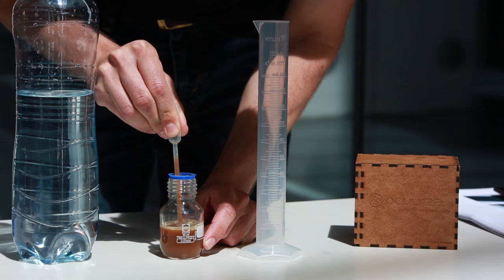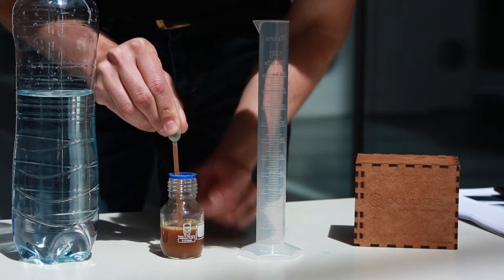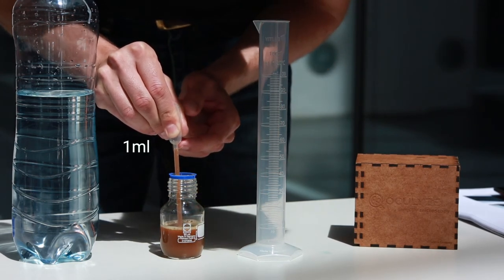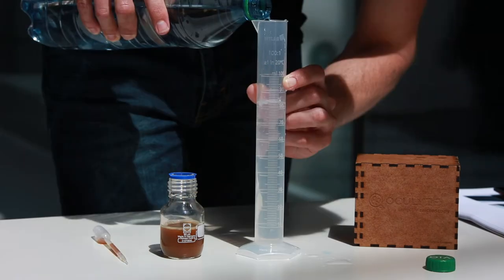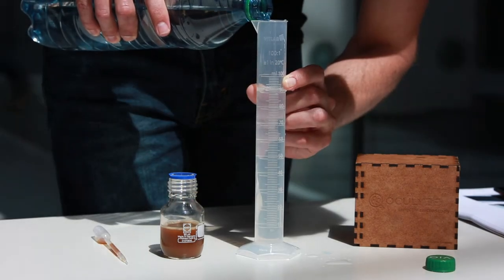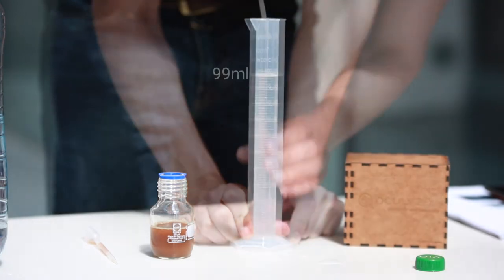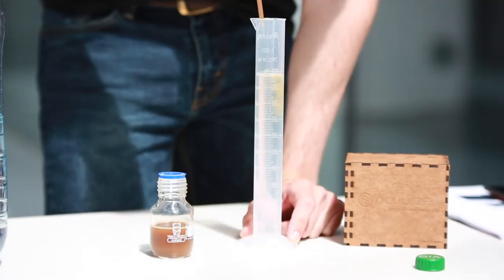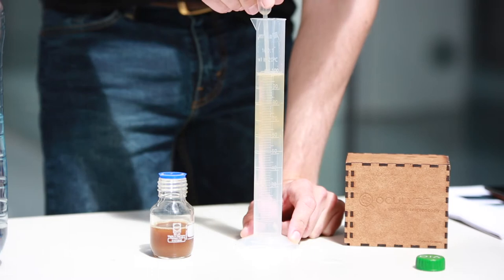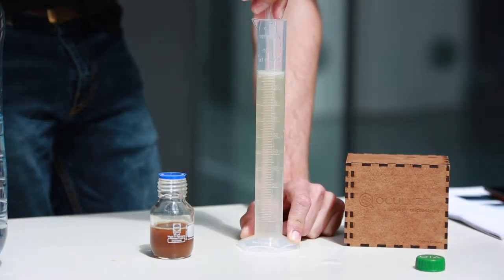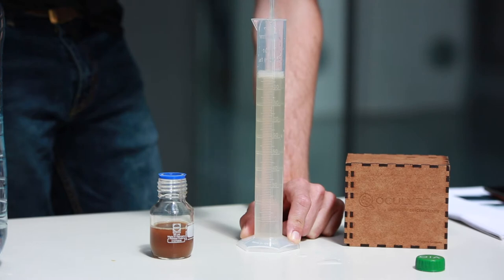Fill your Pasteur pipette with 1 ml of yeast. Step 2. Fill your measuring cylinder with 99 ml of water. Step 3. Empty the Pasteur pipette into the measuring cylinder. Step 4.